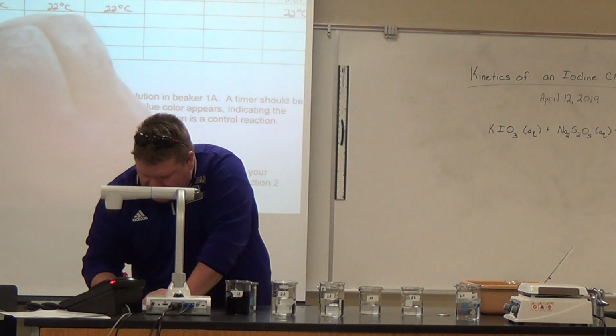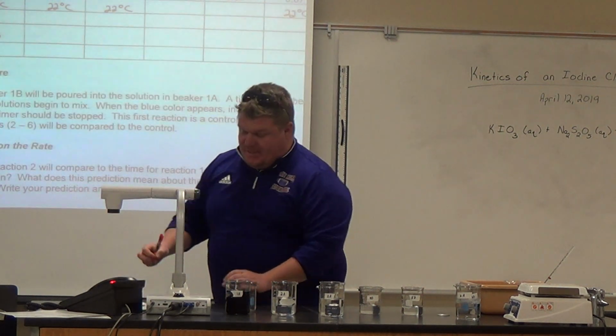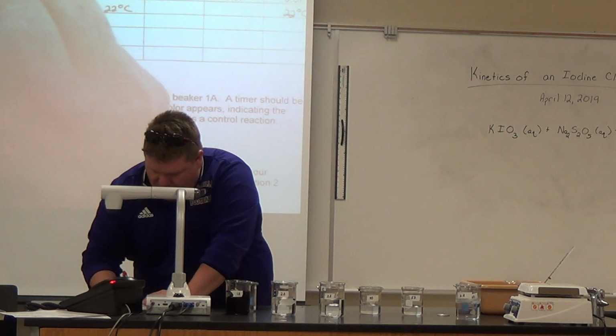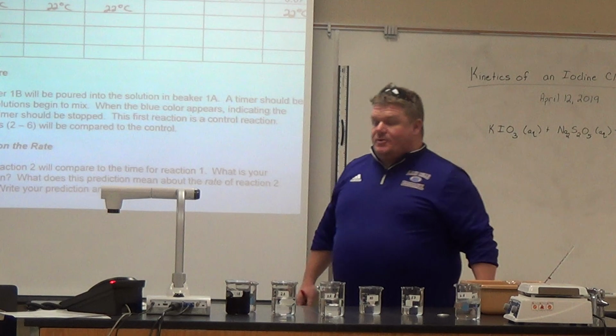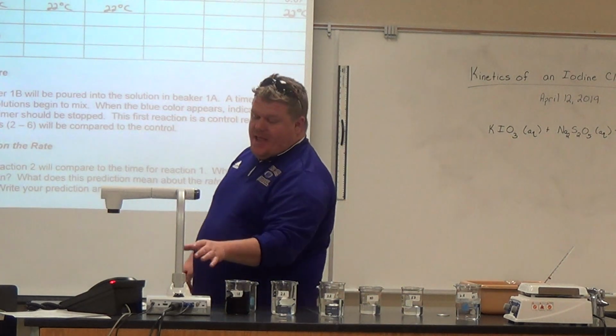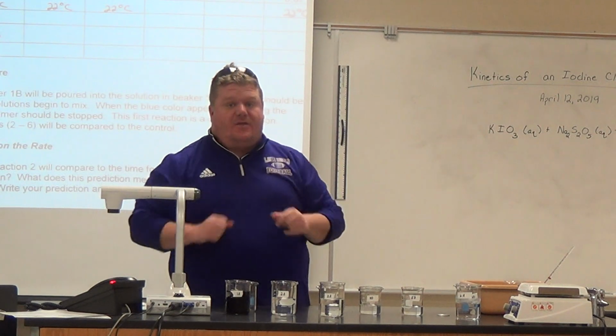I'm just going to round to the nearest tenth. I'm going to say 8.1 seconds. There was no catalyst in that mixture, so I'm just going to put that in there for catalyst. All right, so this first reaction is our control reaction. Every other one we do, we are going to compare to this one.